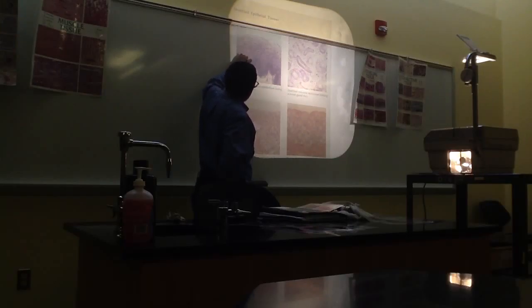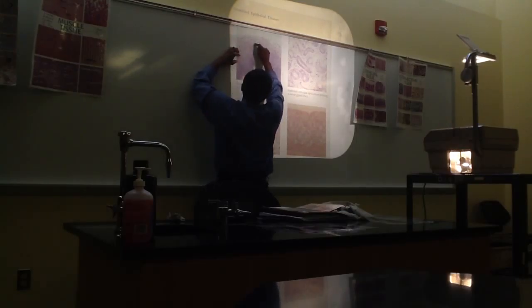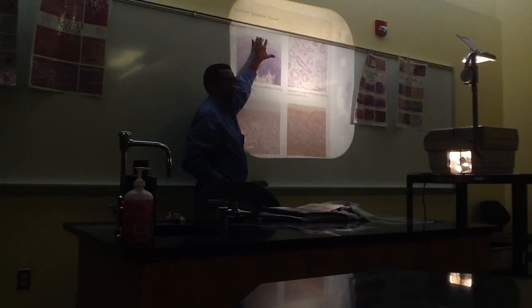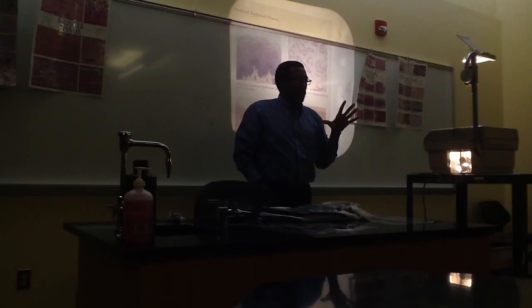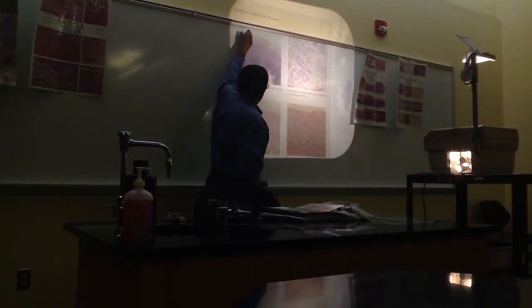So in this case, there are just so many nuclei between the basement membrane, let's say 1, 2, 3, 4, 5, 6, 7, 8, 9, 10, 11 layers of cells, roughly speaking. So this would be truly stratified. Now, when we have stratified epithelium, the name of the shape of the cell will be based upon the shape of the cells closest to the free space.